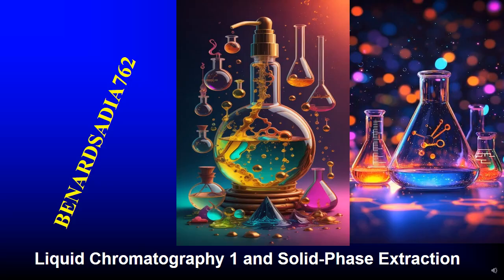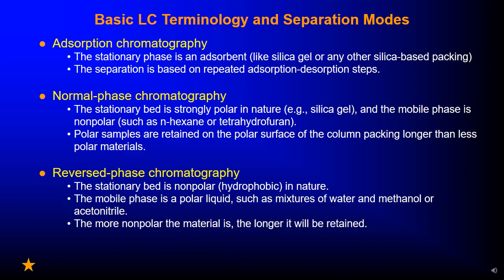Welcome to this channel. Today we are discussing chromatography and solid phase extraction. We are just going to deal with some part of liquid chromatography, not entirely, because we will be having another discussion. So, some of the terminology and separation modes.